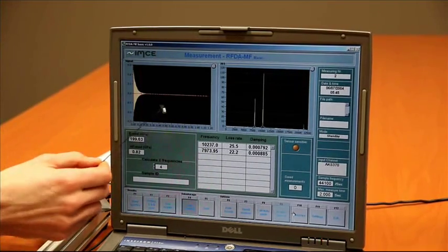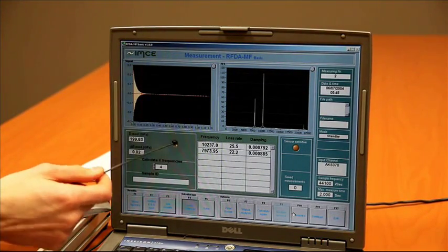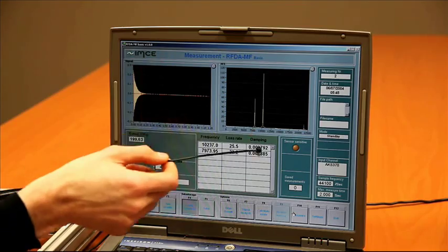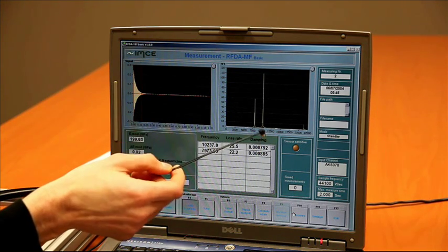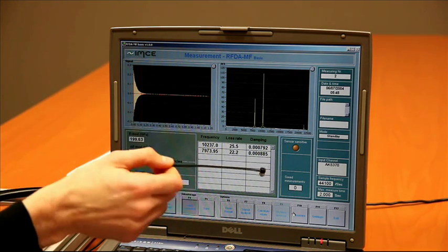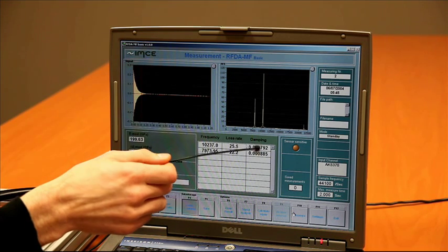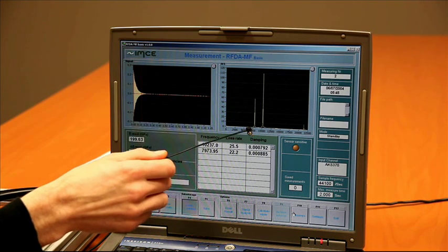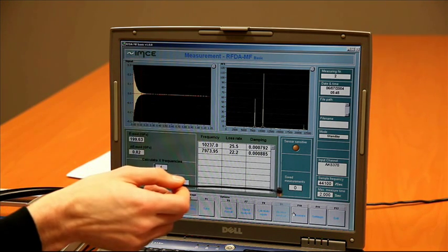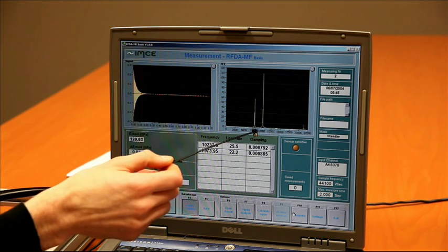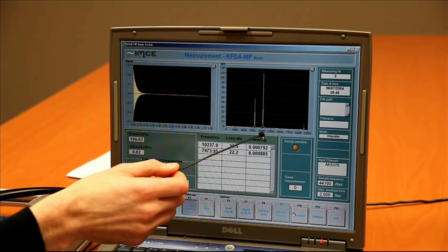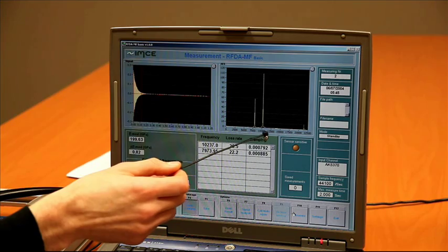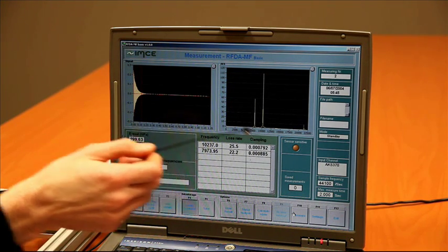Now again, we see the vibration signal that we recorded. The frequency spectrum is a little bit different. We see two peaks this time. The first peak is again around 7900 Hz - that's the flexural frequency. And we see another big peak at around 10,000 Hz. That's the torsion frequency.